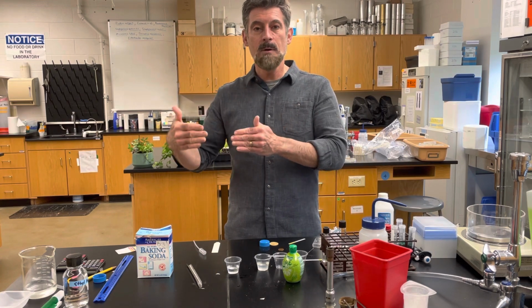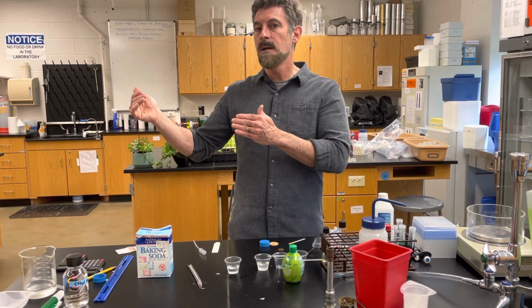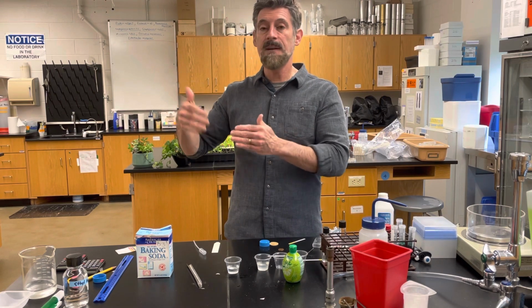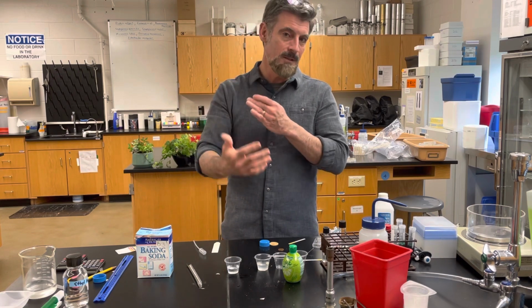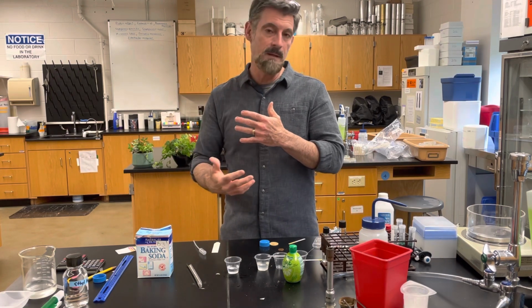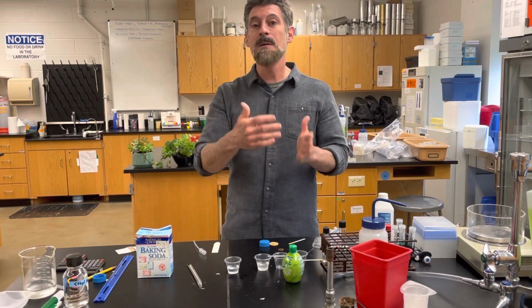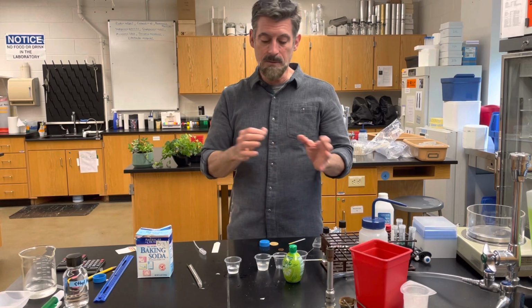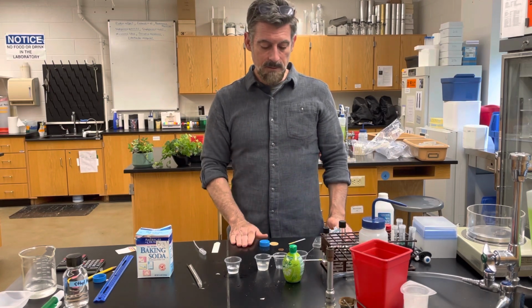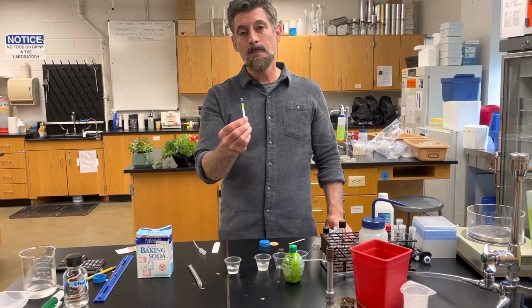This lab is important because it ties into an enzyme lab that you'll be doing that has to do with the effect of pH on enzyme activity. So in general, just the idea of what are acids and bases, what is pH, how does it all work, and then how does it affect the activity of enzymes, all sort of ties together. So this is a very simple lab that you can do at home with some household items, but you have to have the pH test strips.